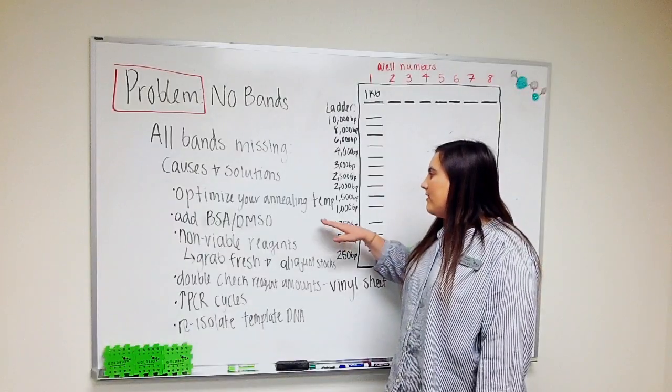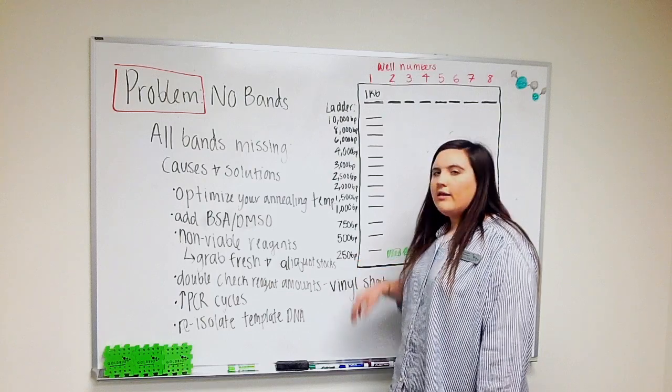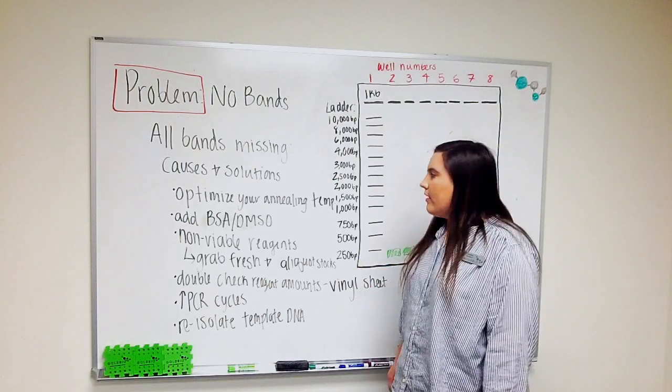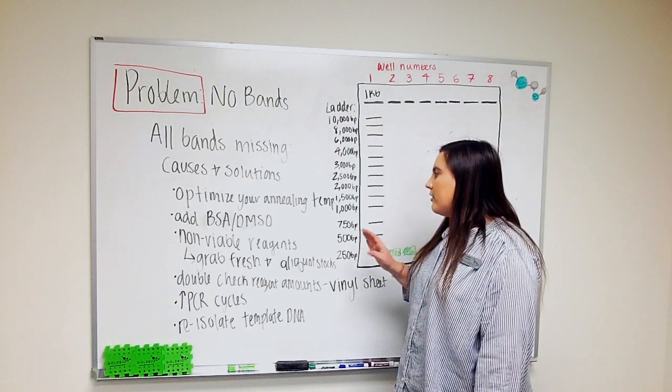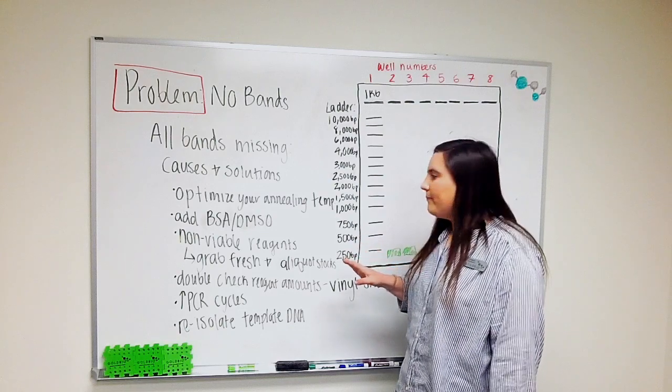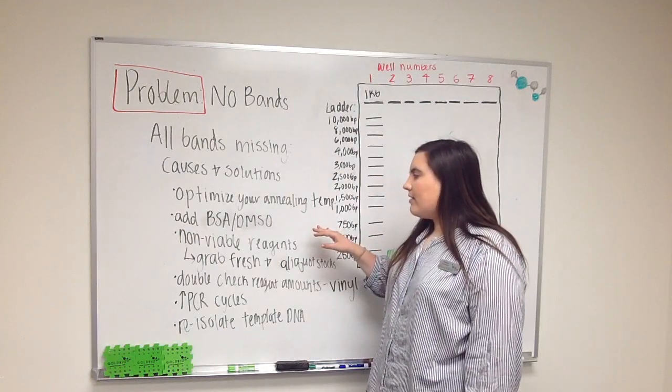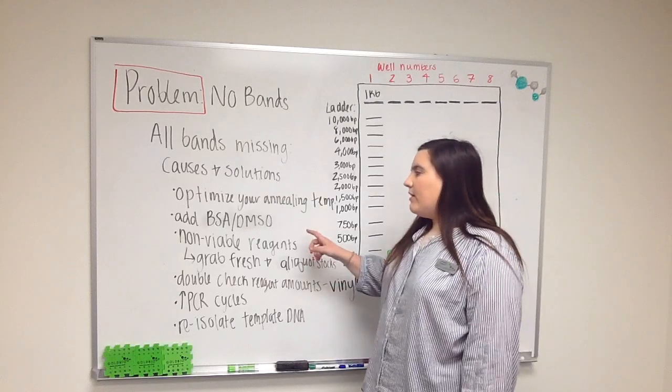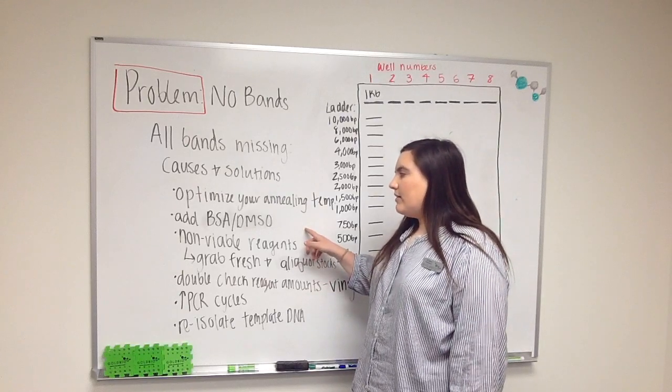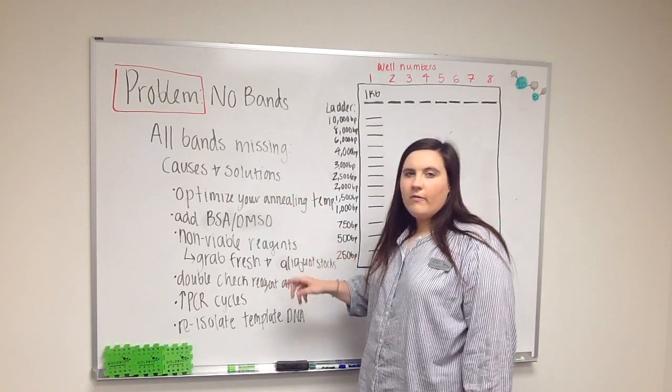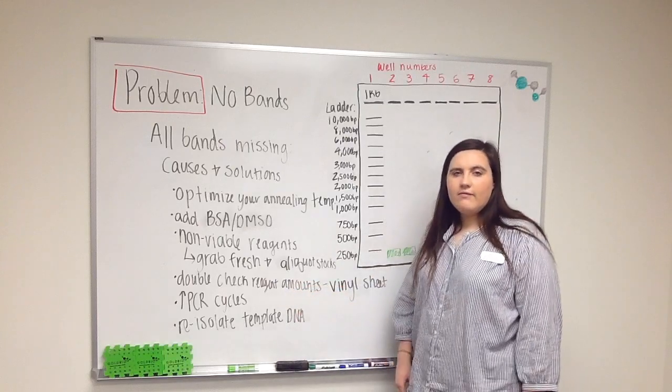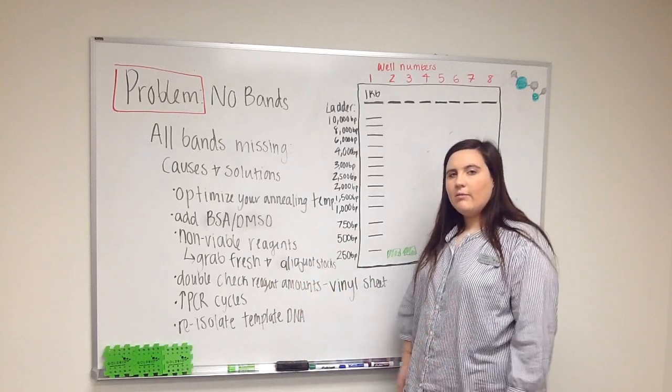One thing you can do is optimize your annealing temperature by checking the melting temperature of your primers and making sure that annealing temperature is optimal for what you're trying to amplify. You could also try adding BSA or DMSO. BSA will prevent your reagents from sticking to the vial. DMSO will prevent any GC-rich content from folding up on itself and not being able to be amplified.